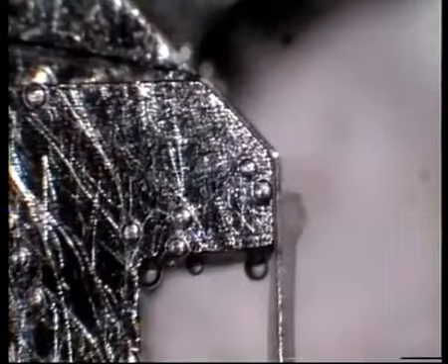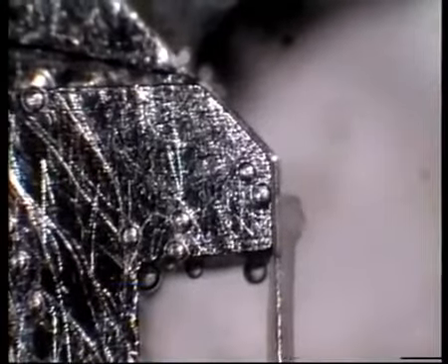The result of the first part of the mounting is shown here. You have the vessel fixed at the top end, but at the distal end it can move freely in the longitudinal direction.